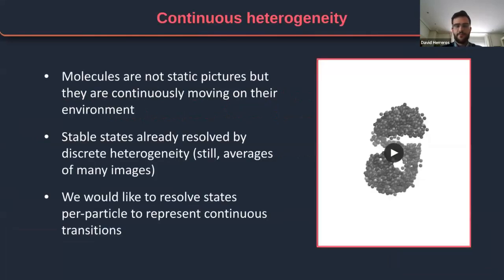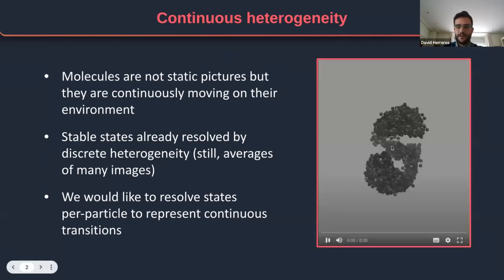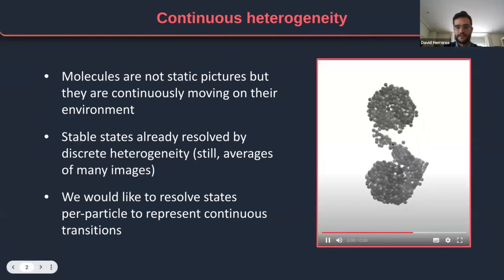So as we all know, molecules are not static. They are continuously moving and changing conformation. And those conformational changes actually change the way the molecules function, the biological function of the molecules. And that's why in CryoEM, we are very interested in trying to extract several conformations from our data, which is classically done through 3D classification, which is a good first approach, but is not perfect because we are getting a very reduced number of states. And we know that in reality, molecules move in a more continuous way, like in this video.